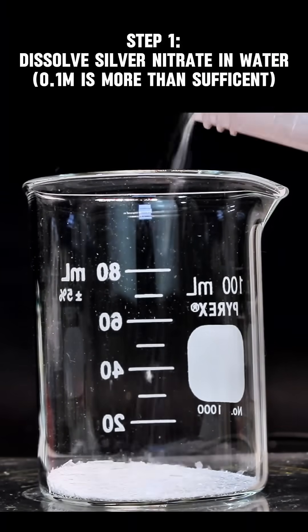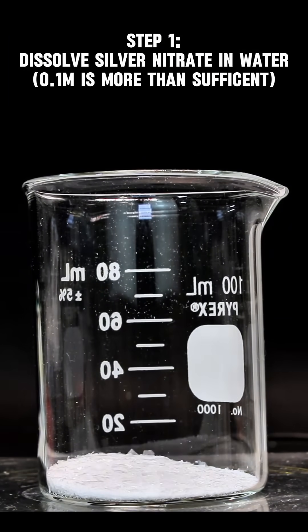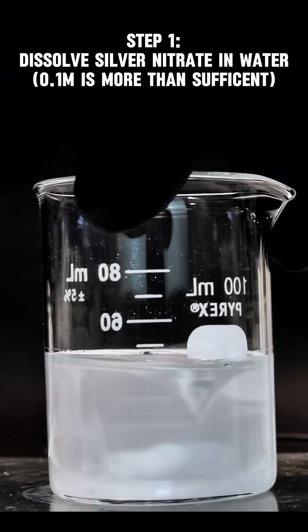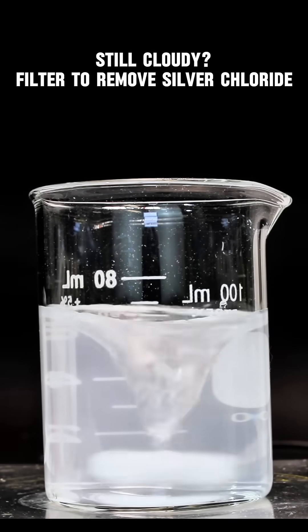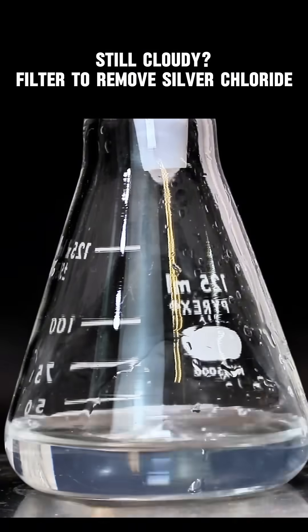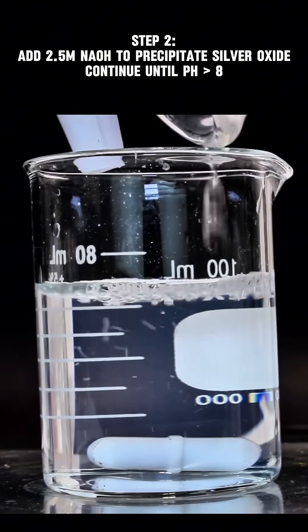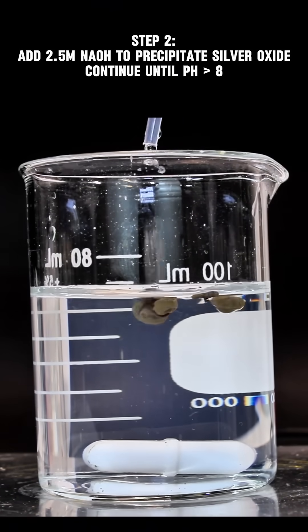To get started you need a chemical called Silver Nitrate, which I made in part one and you can also buy on eBay, but it's incredibly expensive. You want to begin by dissolving the silver nitrate in distilled water so that you have a solution that's at least 0.1 molar. As you can see here, my solution is pretty cloudy, and that's due to the formation of very small amounts of the incredibly insoluble silver chloride. I go ahead and filter this off and then return my silver nitrate solution to the beaker.